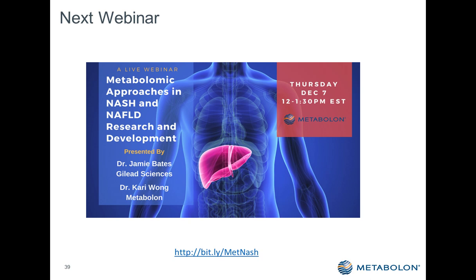So I don't have an NMR on site. I have done NMR in my past at GlaxoSmithKline. Do I think that NMR has a place in metabolomics? Sure. My understanding of NMR metabolomics analysis is in fingerprinting, so measuring changes that happen rather than giving a full screen of every compound that is detected. And in that regard, I think it fulfills a useful role.